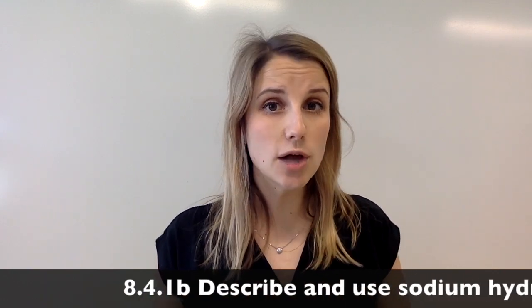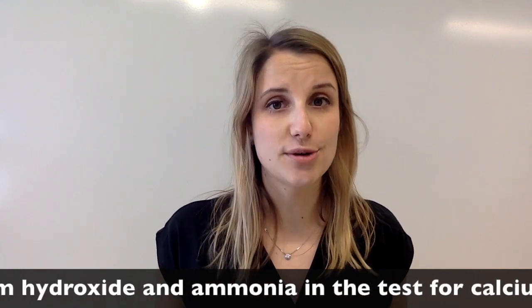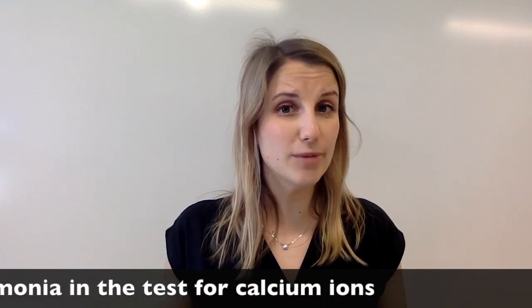That is it for how you test for calcium 2+ ions. You get an insoluble white precipitate when you react it with sodium hydroxide, and pretty much no precipitate when you react it with ammonia.